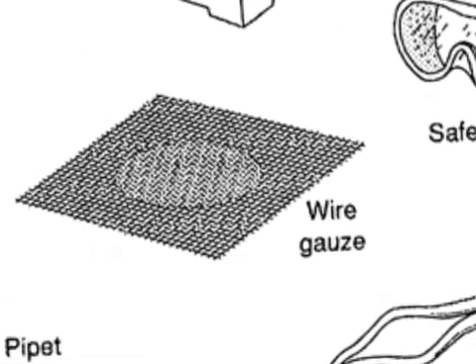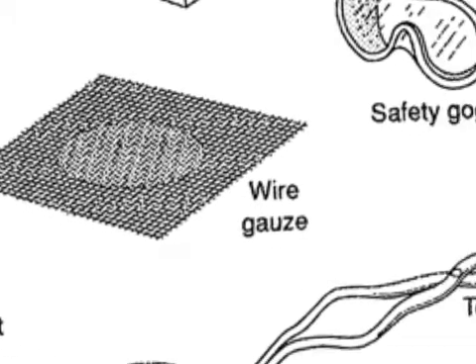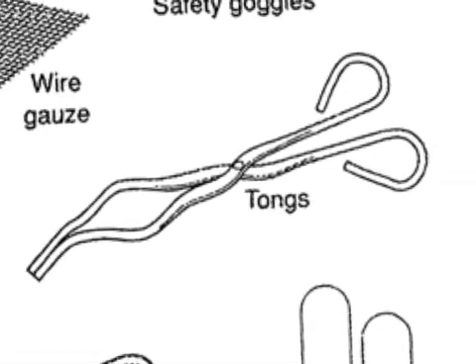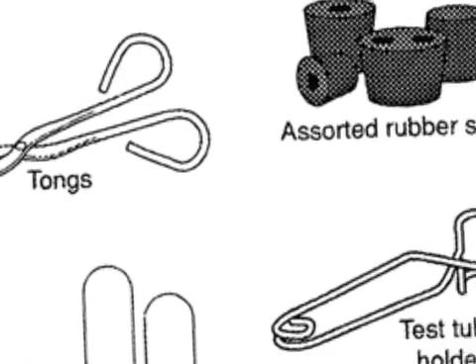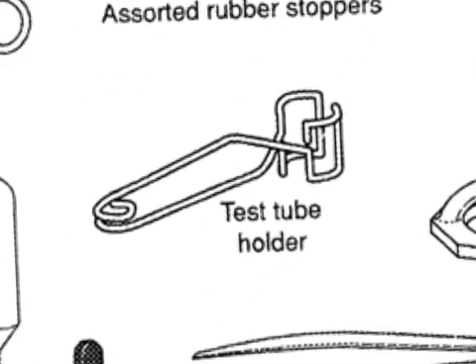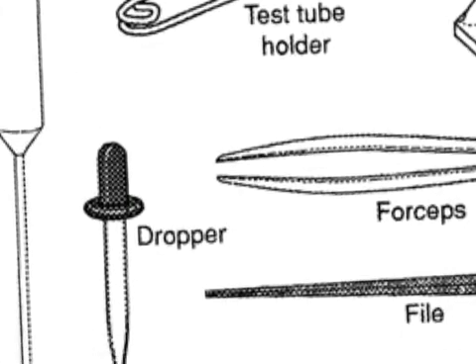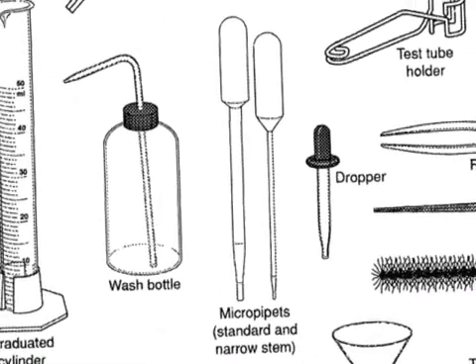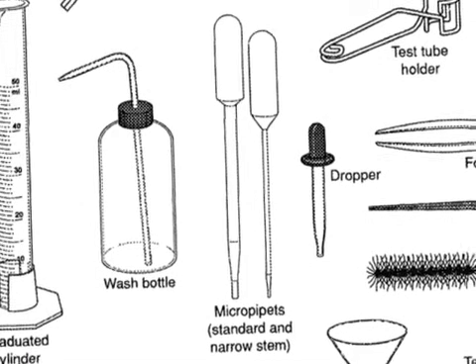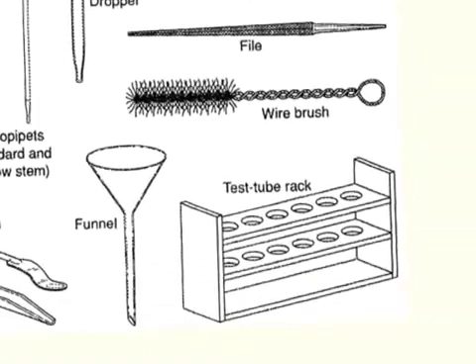A wire gauze we use on the ring stand to hold beakers more stable. Tongs are used to hold beakers when they're hot or excessively cold so that you don't have to put your hands on them, to keep you from being burned. A test tube holder, again, is just like tongs, only it's for test tubes specifically. Next up are droppers and micro pipettes. These are to count drops whenever we're mixing solutions. A test tube rack holds our test tubes whenever we're looking at reactions.